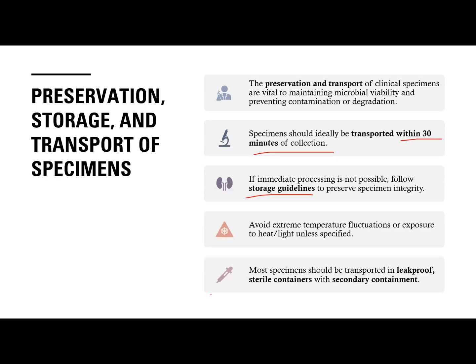Paki-memorize ito. Then avoid extreme temperature fluctuations or exposure to heat or light unless specified. Most specimens should be transported in a leak-proof container that is sterile with secondary containment.